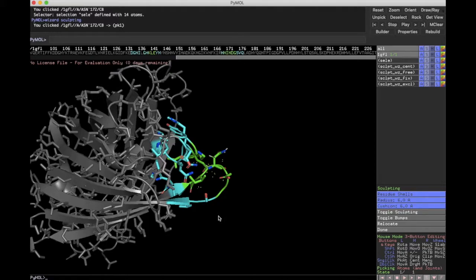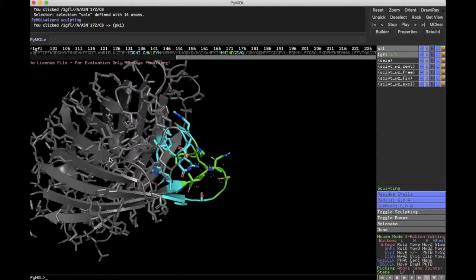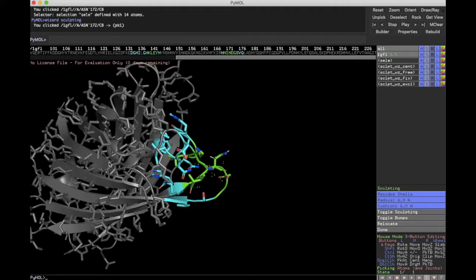But in this case, it's pretty cool that you click on the atom, it isolates it from the rest of the protein, and then does the energy minimization. And this is pretty important because to do energy minimization on this entire protein would take a long time and require a decent computer. But by isolating it to a region where the majority of the impacts are involved, it helps you to do a rough model right off the get-go.